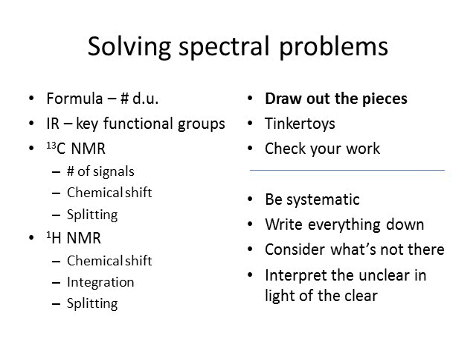Then, I take a look at all the notes I've come up with, and I draw out the pieces. I should be able to figure out, based on the formula and based on the information from the spectra, what sorts of things are involved in that molecule. That is, I've got a CH3, and I'll write down a CH3. I've got a CH2 that's next to oxygen, so I'll write down a carbon with 2 hydrogens and an oxygen attached, etc. No matter what I've got.